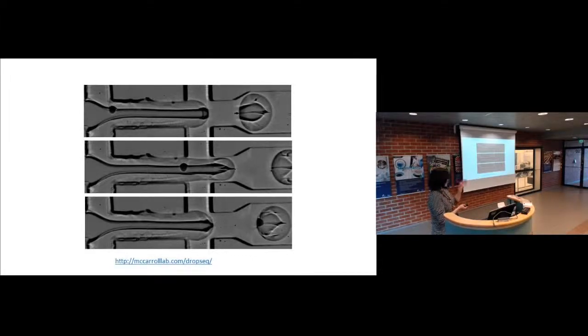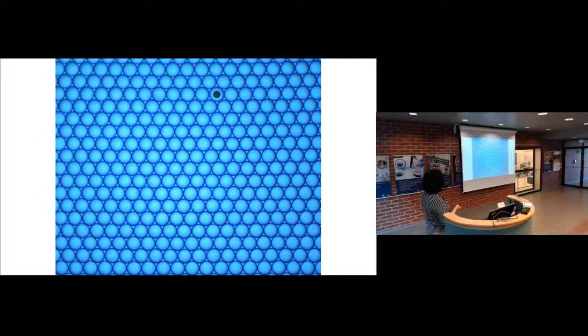You can quickly see the beads are going there, and a little hint of, okay, there was maybe a cell, but it's very rapid. So we run through 180,000 cells and 180,000 beads we put there, and it takes 15 minutes to run them through. And the emulsion looks like this. Normally we don't see cells anymore because they are lysed right away, but in this experiment we didn't use the lysis buffer, so you can still see the cells and the beads.